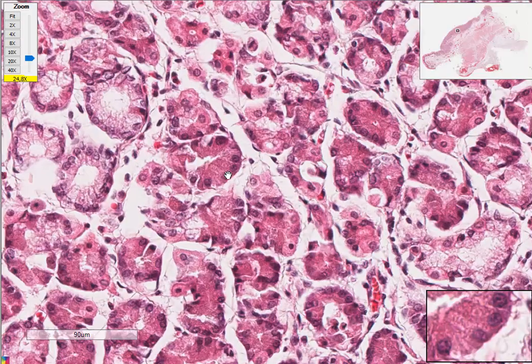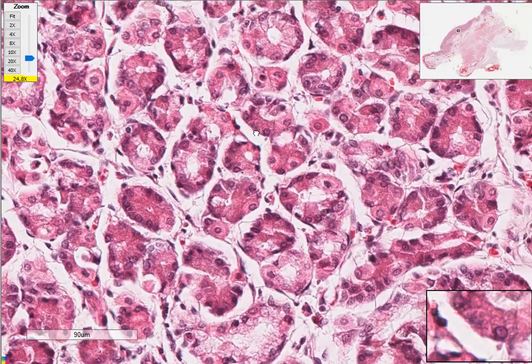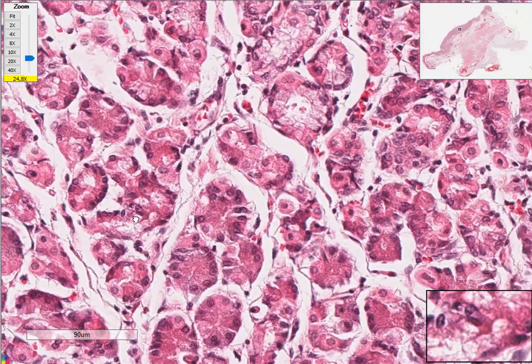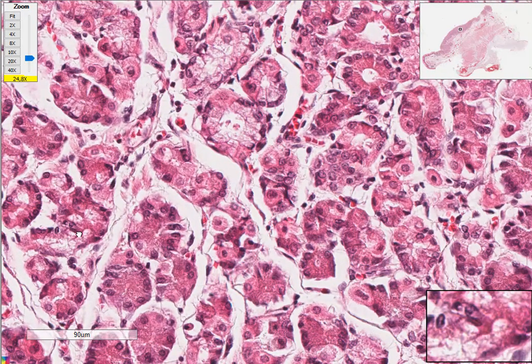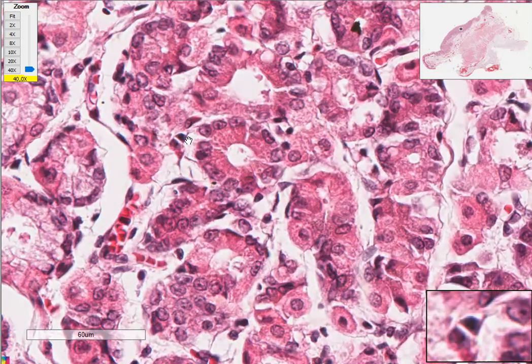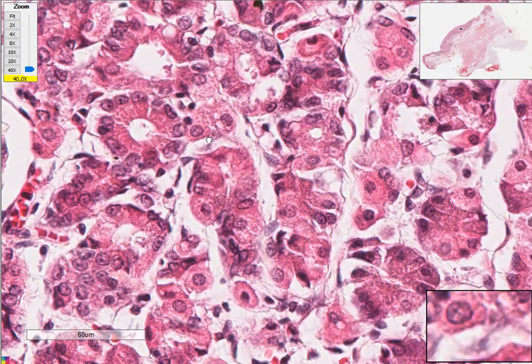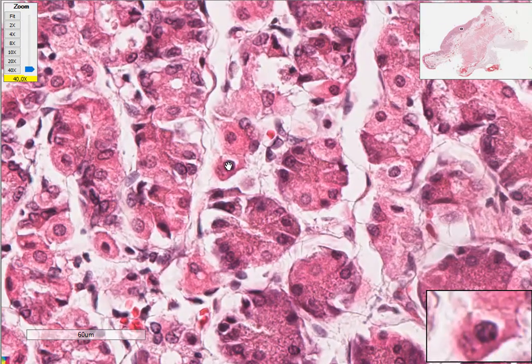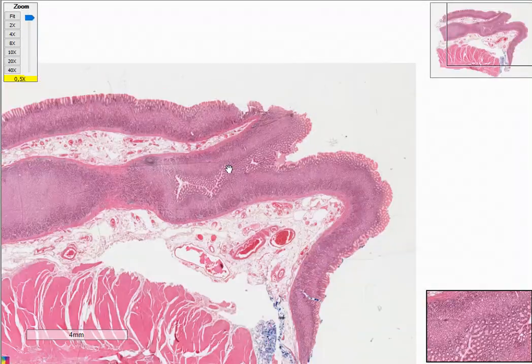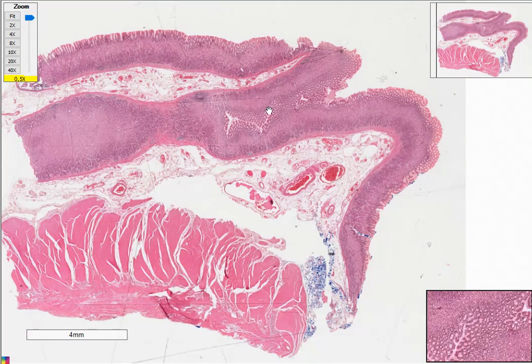And I think probably here we can pick up a clear enteroendocrine cell. I really want to show you one nice clear one. Maybe I'm just unlucky. Here they are. You can see the cytoplasm is more eosinophilic, it's more clear, sorry. Yeah. Okay, so there are some small clinical pearls that we need to know concerning the stomach.